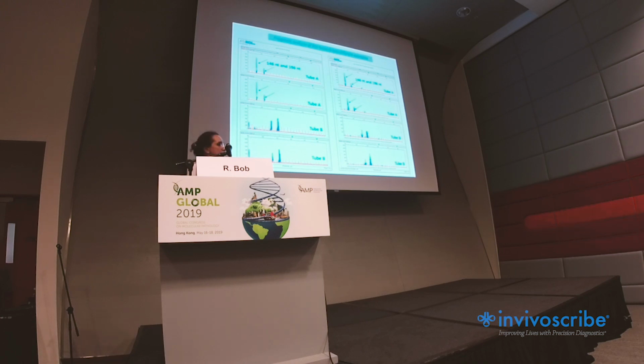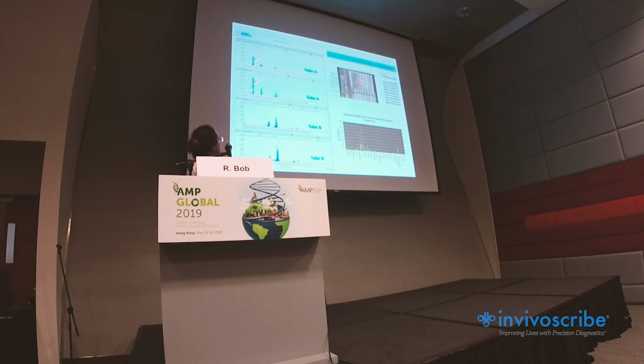And that's not a non-specific peak. It's really a specific peak, but it's representative of many different sequences which produce amplicons with this base pair length. So we always need to apply complementary heteroduplex electrophoresis.